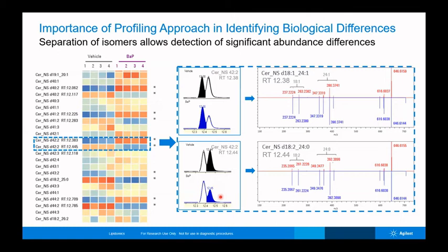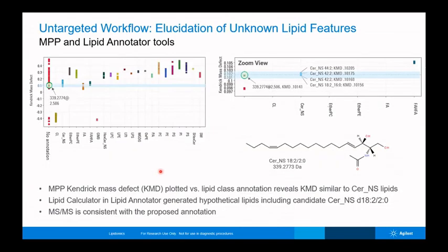It was nice that they were able to highlight classes of lipids, but digging deeper with more profiling lipidomics, you can go a little bit more in depth and tell for a particular lipid if it's up or down. Of course, in this case, you need both good sample preparation and a good chromatographic method. By looking at the same data, they wanted to dig a little bit deeper with the untargeted approach. Working with that, they found one particular mass, 339, that was significantly changed between the controls and the cells treated with the two compounds, the combination drugs.